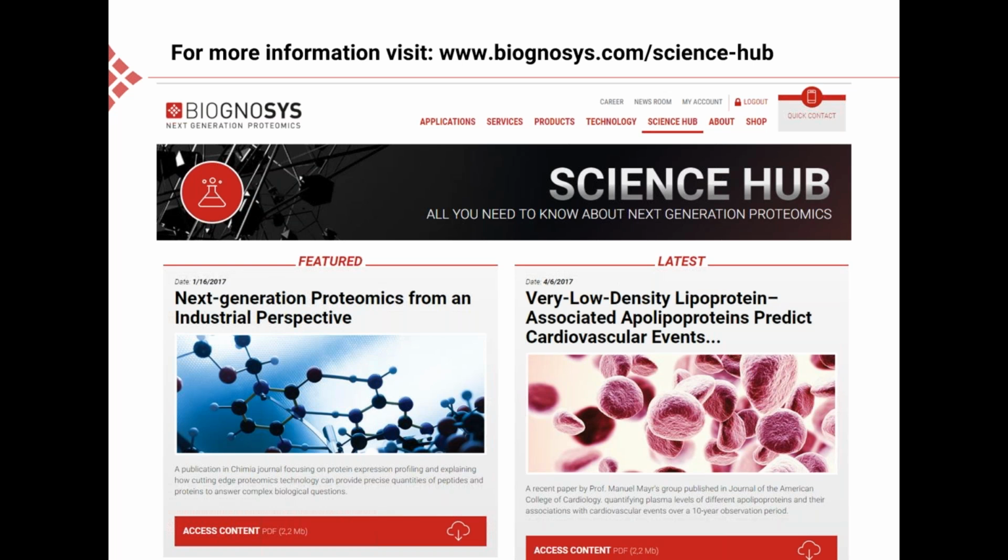But you can obviously just get your candidates from SpectroNaut and then make a panel using the same library with the new panel generation workflow, and just select those peptides, your candidates, for making a final PRM/MRM panel.